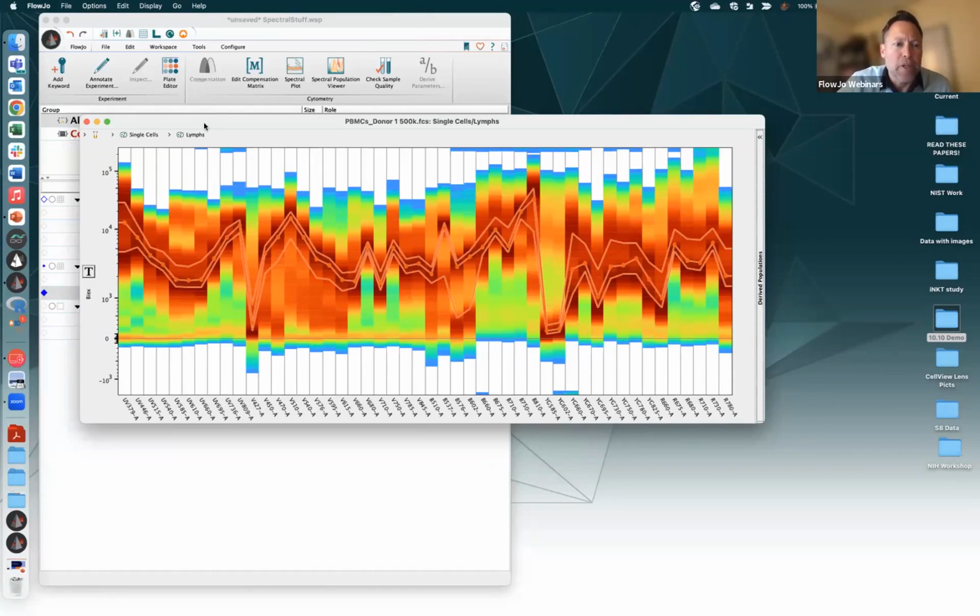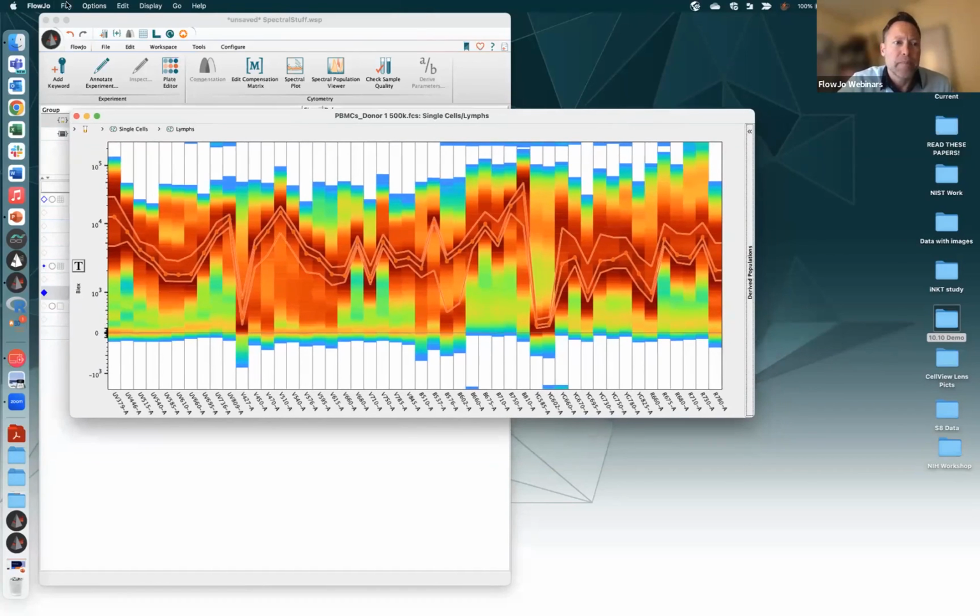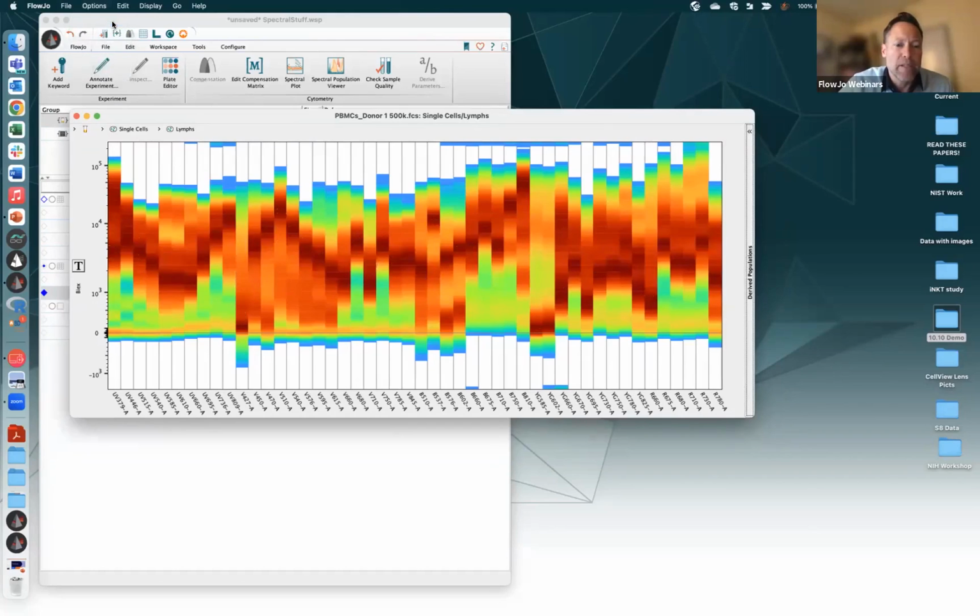Okay, and so let's look at what some of the options are. So options: bands, violins, and density are all options. At the moment, I have density and bands showing. So if I turn off the bands, there's just the density.